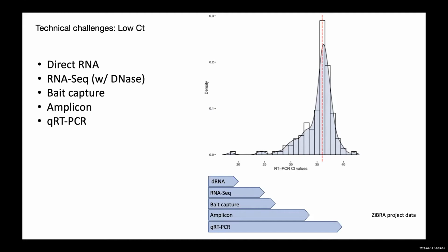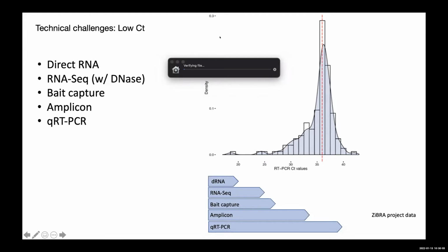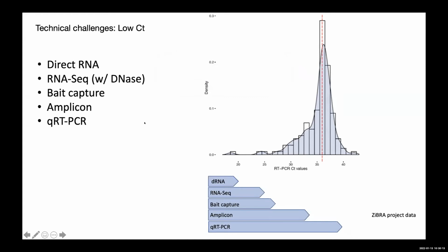And these last 3, moving away from metagenomic methods into targeted methods now. So the targeted methods would include bait capture, where you try to design probes which will cover your genome. The probes are very long, which means that they have a high tolerance of mismatches compared to amplicon and qPCR. And then usually once you've enriched your library using bait capture, you then combine it with a standard library prep approach. Amplicon sequencing, which is where you're enriching for specific regions of the genome, targeting amplicons.